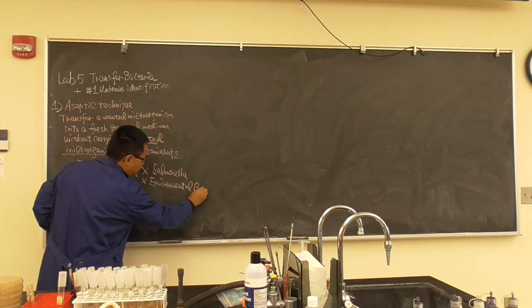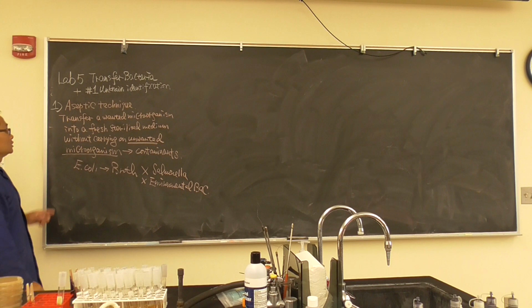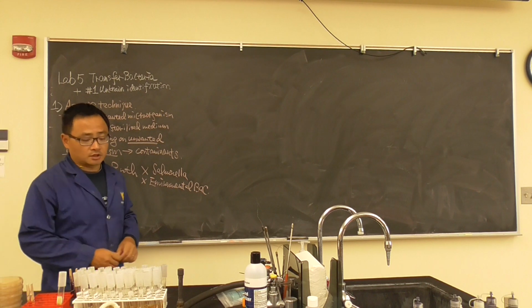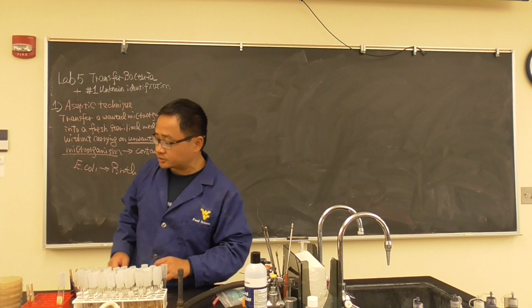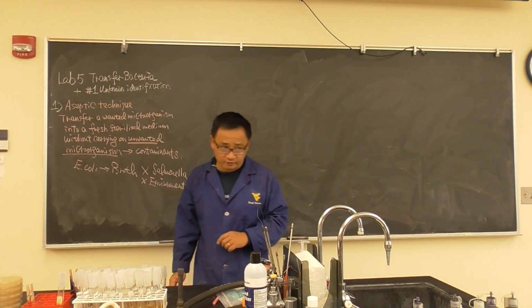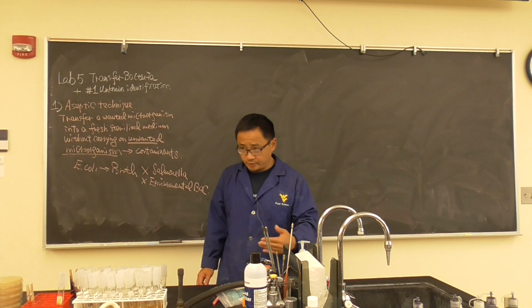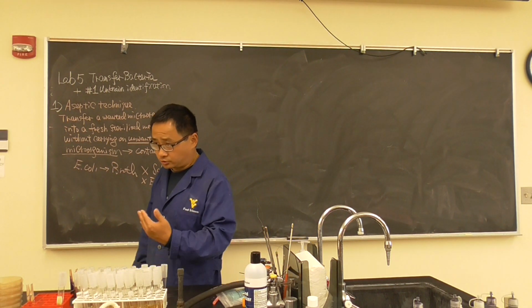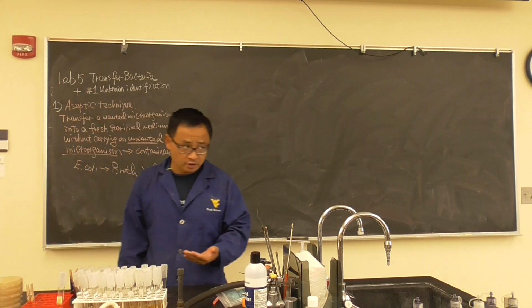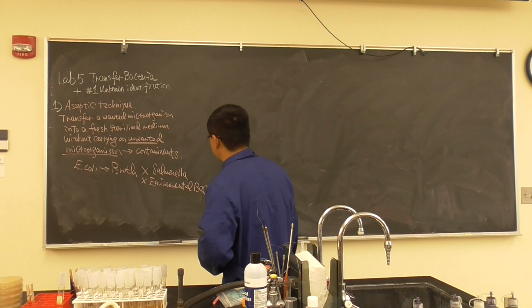Let's say the bacteria from the bench, from your hands, and from the air. This is a very simple but very important concept, which means you're going to focus on transferring the bacteria you wanted. Do not carry on the contaminants, because otherwise the whole bunch of the media will be contaminated. It also could cause cross-contamination if you are talking about something in the food industry. Okay, so this is the first thing.